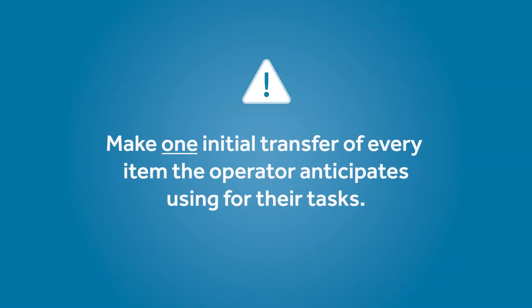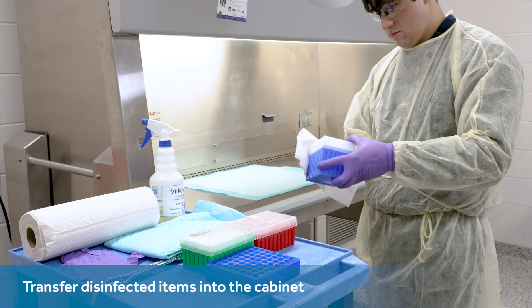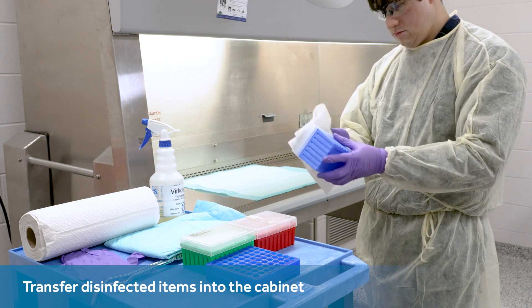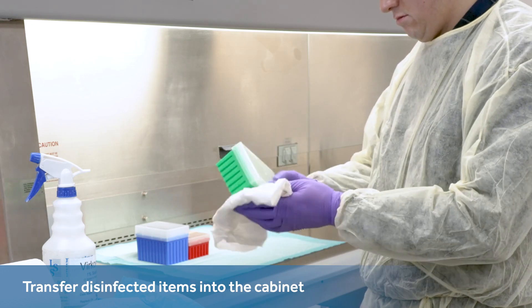Biosafety experts and guidelines alike commonly suggest making one initial transfer of every item the operator anticipates using for their task so that they will not need to cross the airflow later on to make additional transfers of items into the cabinet. For this reason, many also suggest outlining all items on a document. However, other recommendations caution that the cabinet should not contain more items than the bare essentials, often warning about the effect items can have on the cabinet's airstreams. Transfer the items to the cabinet from the table or cart using flat, straight-in, and low-speed arm insertions. A superficial disinfection is commonly recommended for any items headed for the biosafety cabinet.